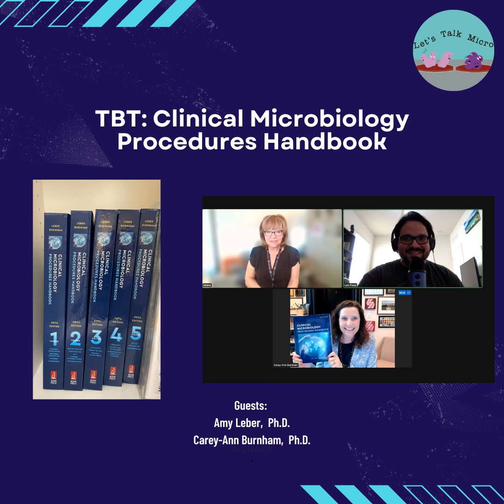Sometimes the SOPs are not clear, or we just want to understand, why are we not reporting this organism? So a lot of questions arise on the bench, and sometimes you hear different information out there. So it's a great place to go, look at the source and see, okay, this is what they're saying, this is the guidance that they're offering on this.